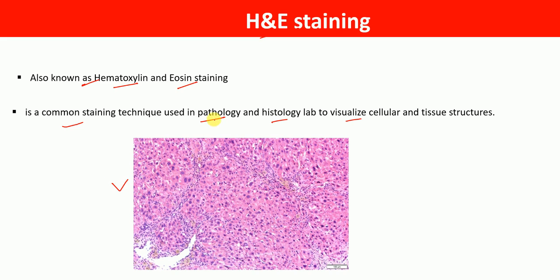As you can see, the cellular structures are very easily visible. Nuclei have been stained with blue coloration, whereas the cytoplasm and other cellular components have been stained with purple or pink coloration.